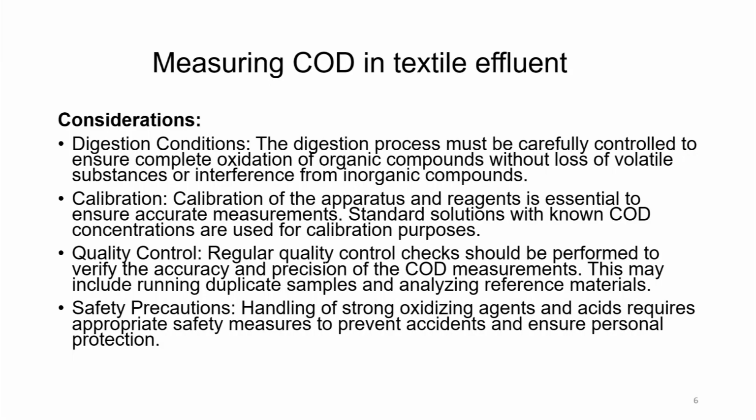We may just measure and we are not sure whether it is right or wrong. So, standards with known COD values have to be used for the calibration of the instrument, and periodically these analytical instruments have to be calibrated from time to time.